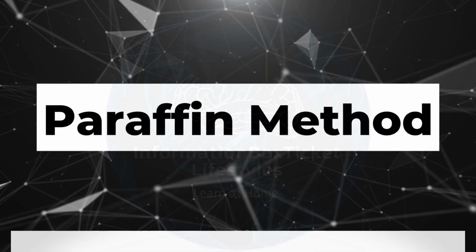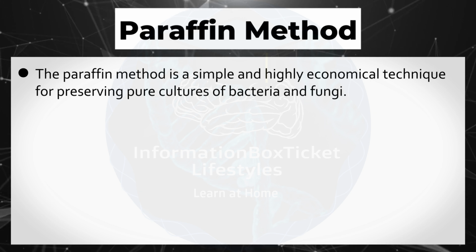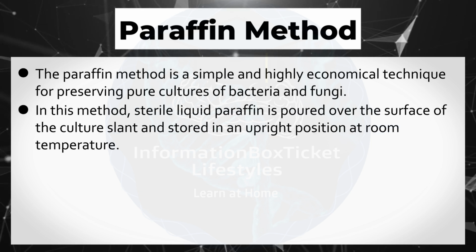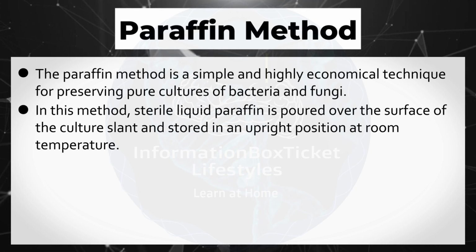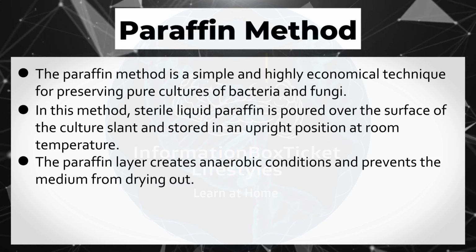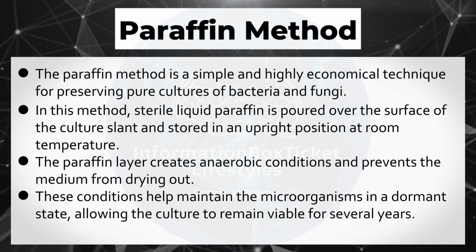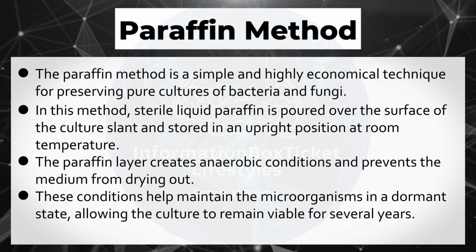Paraffin method. The paraffin method is a simple and highly economical technique for preserving pure cultures of bacteria and fungi. In this method, sterile liquid paraffin is poured over the surface of the culture slant and stored in an upright position at room temperature. The paraffin layer creates anaerobic conditions and prevents the medium from drying out. These conditions help maintain the microorganisms in a dormant state, allowing the culture to remain viable for several years.